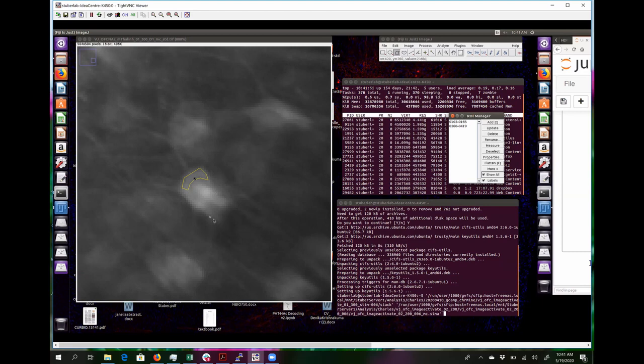Similarly, if I were to draw this cell, I would say I draw here. Something like that does not overlap with the other cell. I can't see anything else going through there, which you can verify here. Nothing here corresponds to anything that I can see. So I'm going to say that that's part of the cell. That's tough to see though.